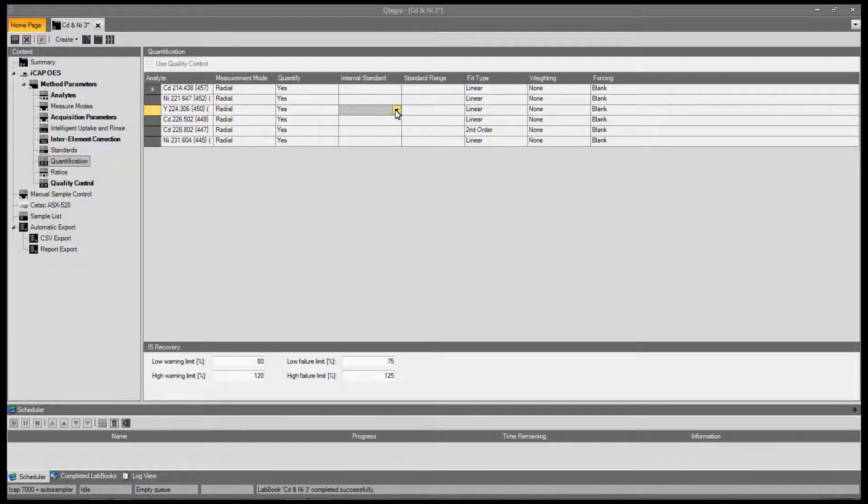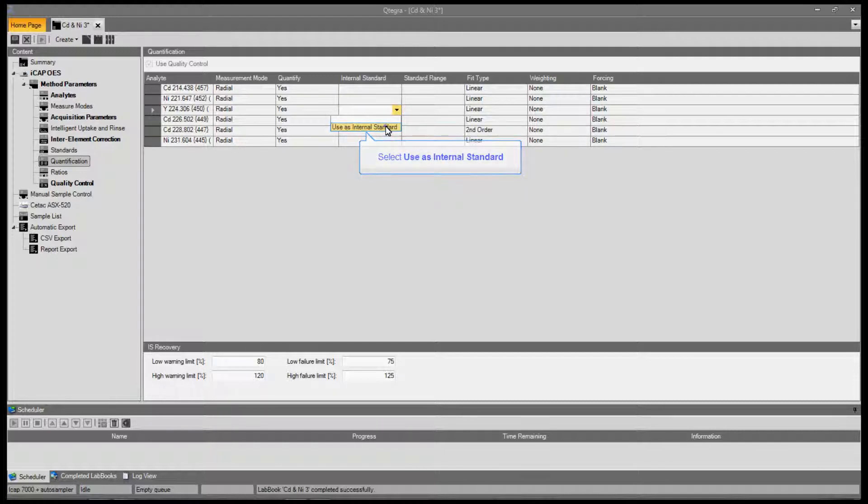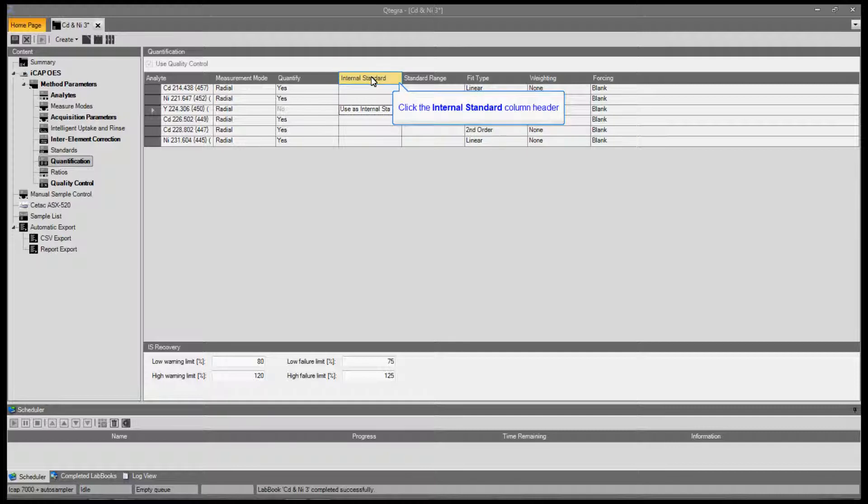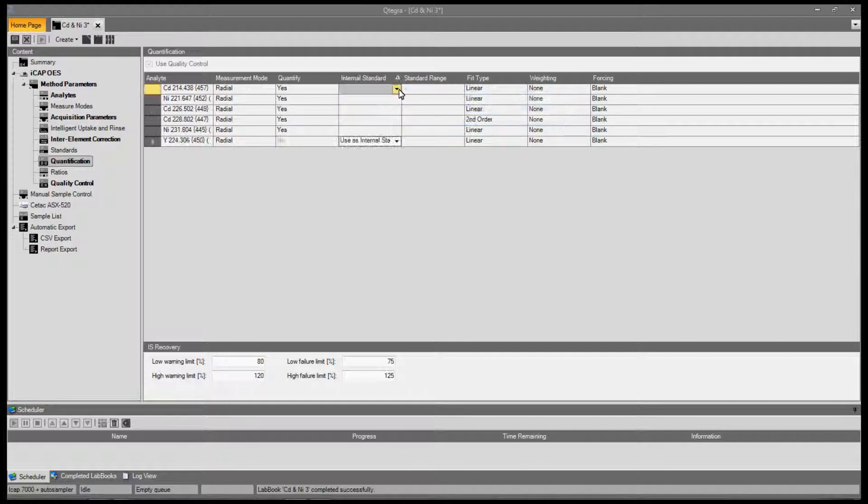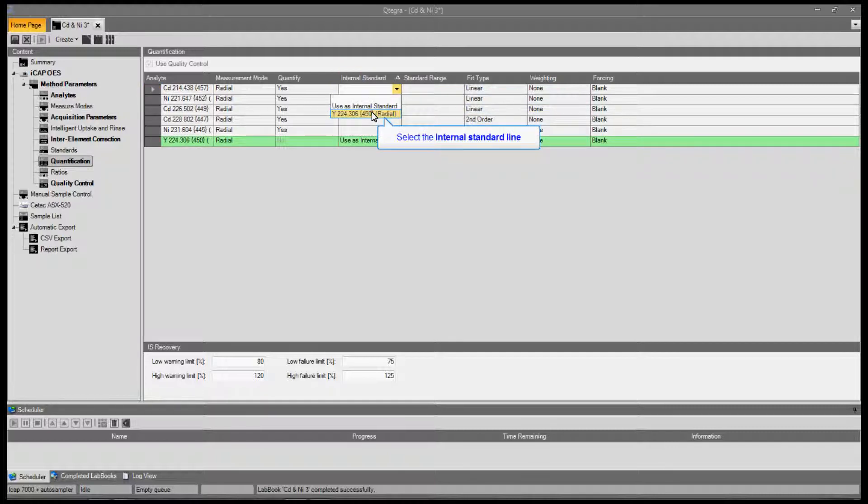To assign an internal standard line, open the menu and select Use as internal standard. For ease of use, click the internal standard column header. Open the internal standard menu and select the internal standard line.